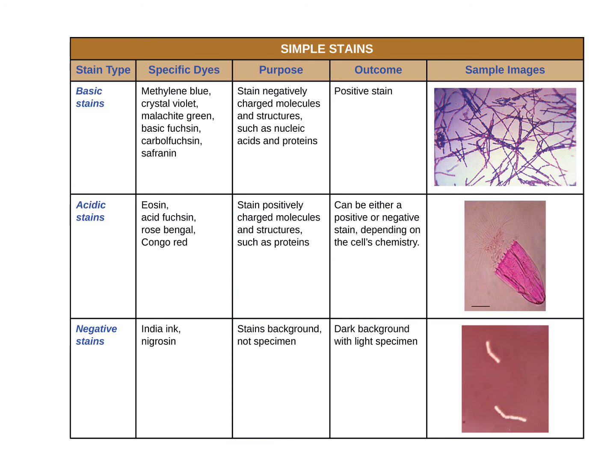If you hear the word negative stain, negative stains are like in art where you color the negative space. Basically, it'll be a chemical that does not get into the bacteria, but it stains all the background space, and it's the opposite. The bacteria will be clear or transparent against a darker background, but those can be really cool to look at too.